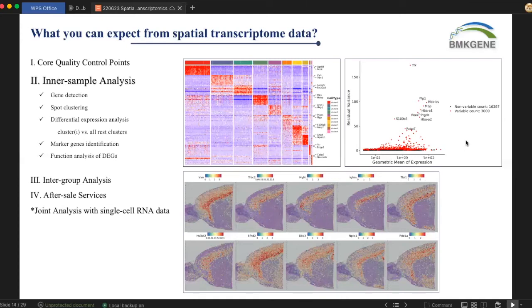Here is another analysis on the hypervariable genes, which means these genes vary across clusters: they are either extremely highly expressed in one cluster and rarely expressed in the others. These marker genes can be very important biomarkers, for example, for distinguishing different tissues, such as normal tissues and disease tissues.